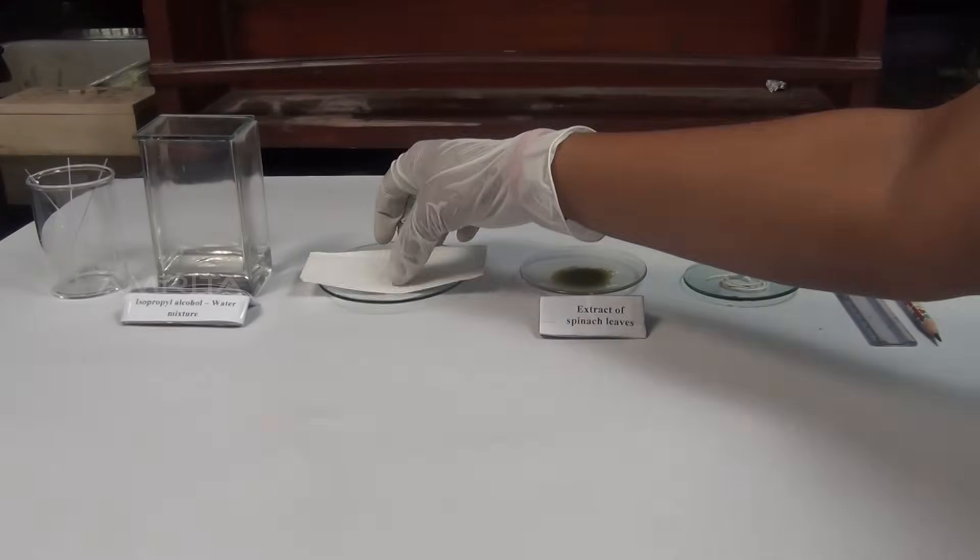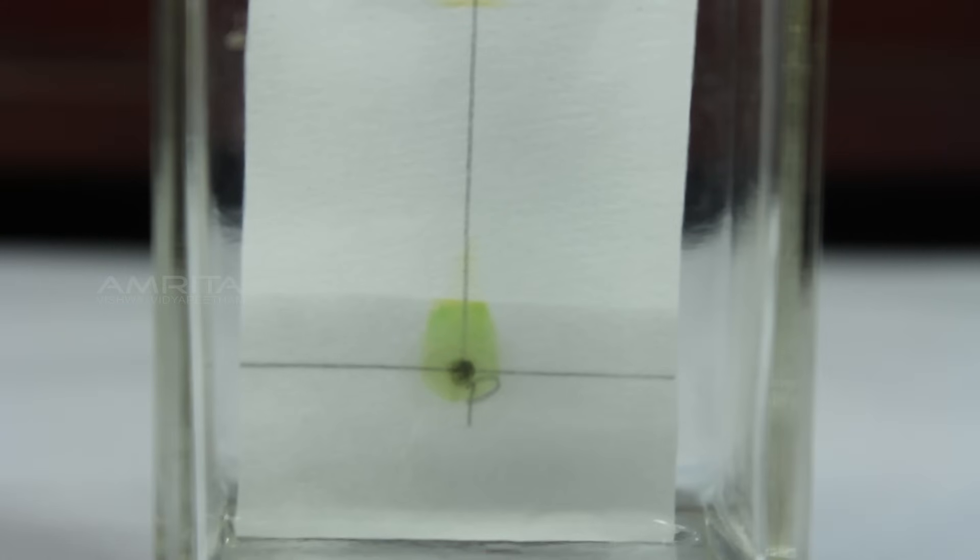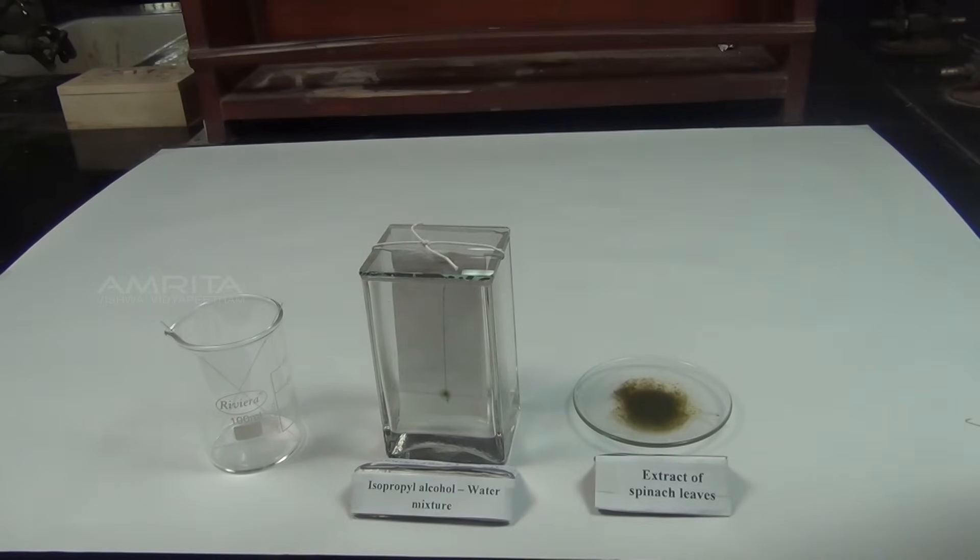The stationary phase is usually a piece of high-quality filter paper. The mobile phase is a developing solution that travels up the stationary phase, carrying the samples with it. When the mobile phase is moved over the sample on the stationary phase, the components of the sample get gradually separated from one another.